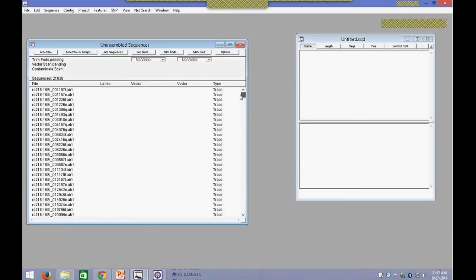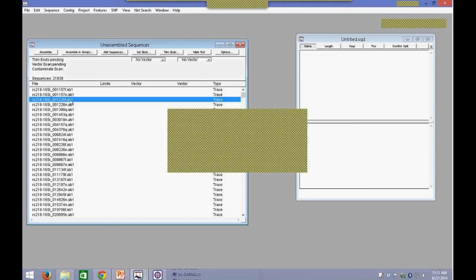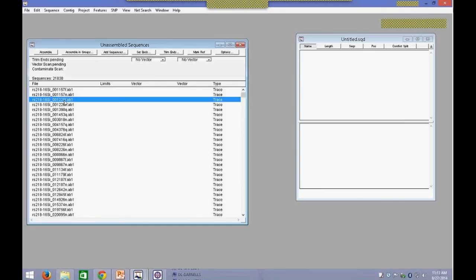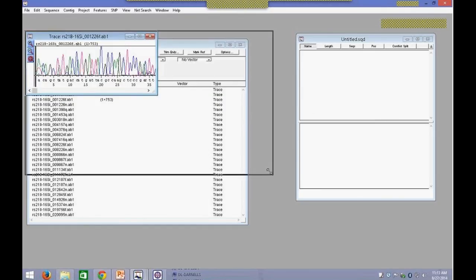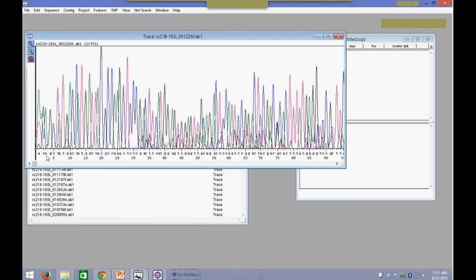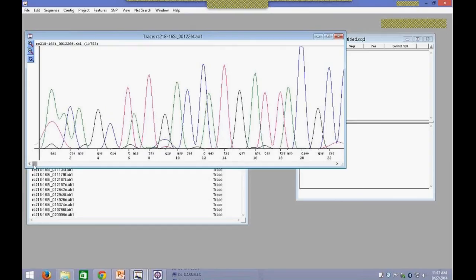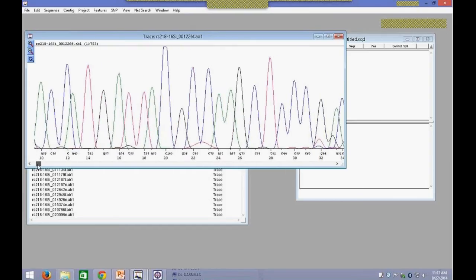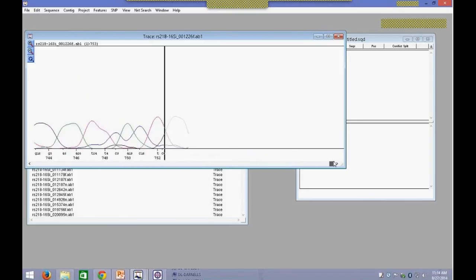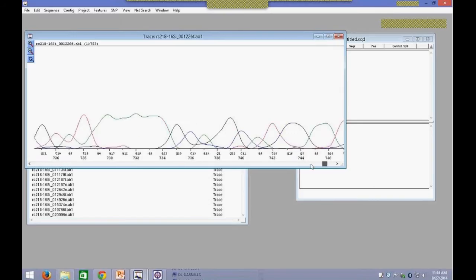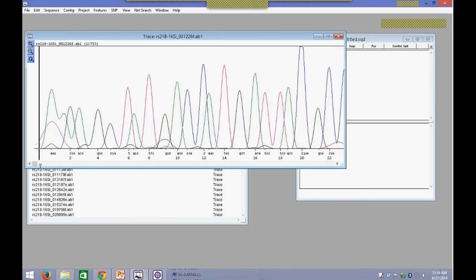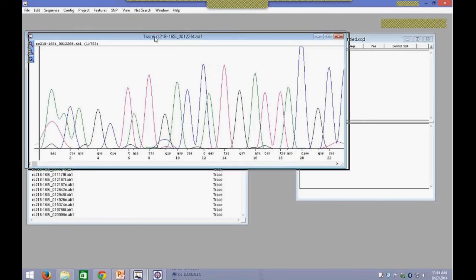Now we see a list of all of our trace data. If you wanted to look at the actual chromatograms for one read or multiple reads, all you have to do is double-click on it. Once we double-click on our read, we can see the chromatogram. At the bottom, you can see the base calls. And if you wanted to see the quality scores, you can press and hold the Q button to switch to Q, and that will give you the quality scores for each base call. Notice that towards the three-prime end as well as the five-prime end, the quality is low — this is quite normal for Sanger data, and the end trimming during the assembly will take care of this.